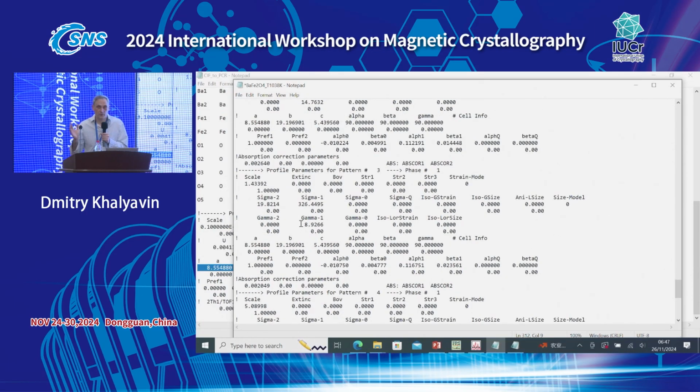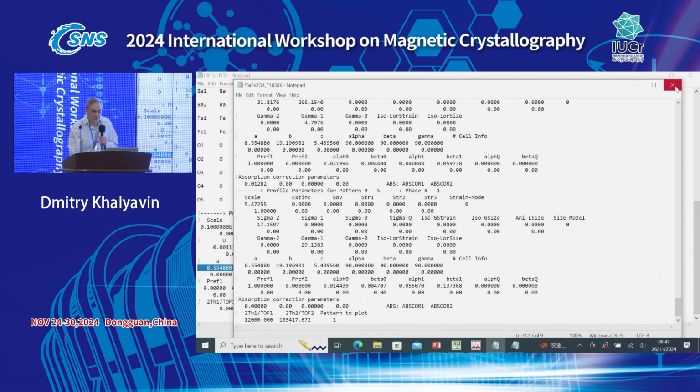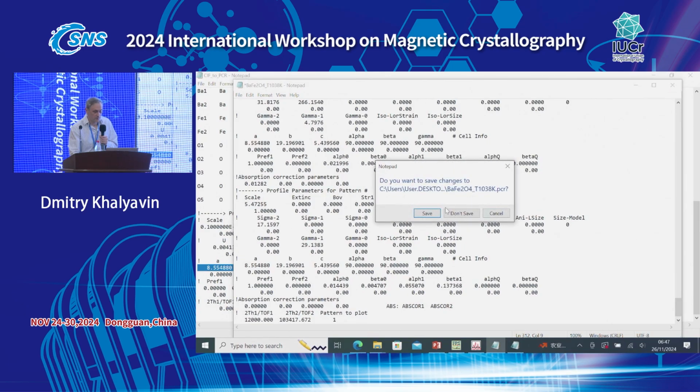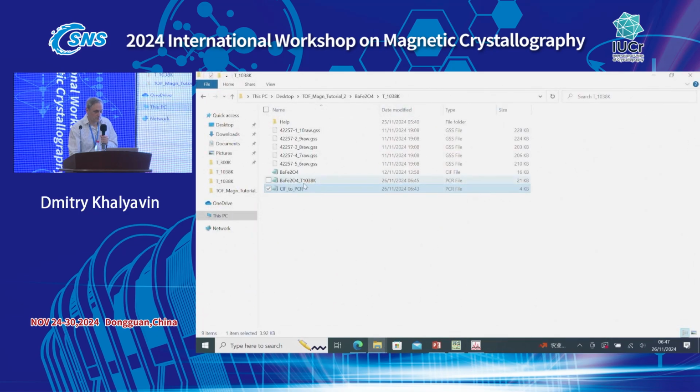And then we will have a look and decide what is our next step. So let's run it and let's have a look. Yeah. So did I change anything?